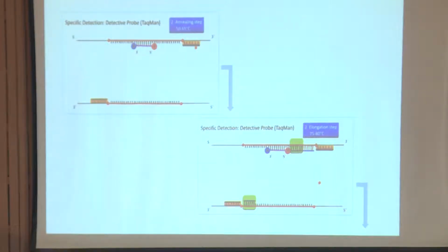Polymerase enzyme, right? When the polymerase enzyme comes after primer binding, it starts adding the nucleotides corresponding to the template. When A is there, T will come. When C is there, it will call G. When G is there, it will call C. When T is there, it will call G. It comes one by one.